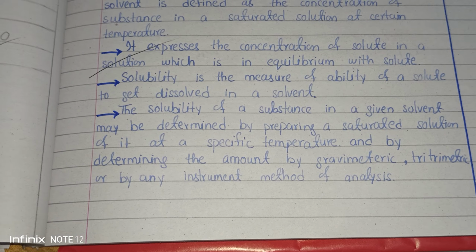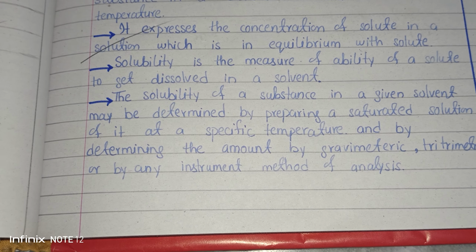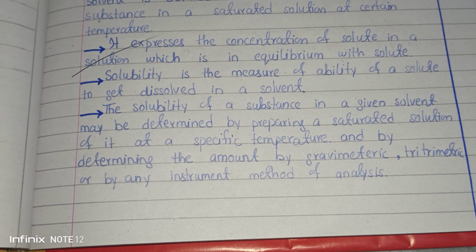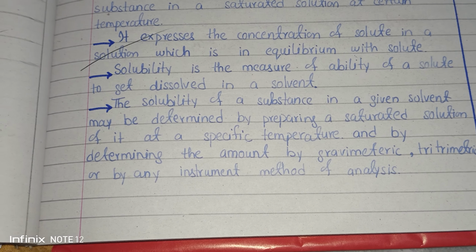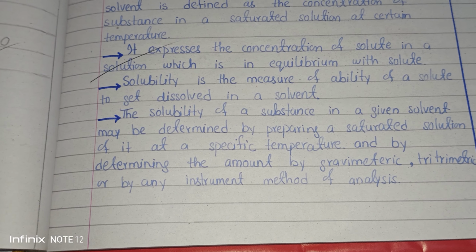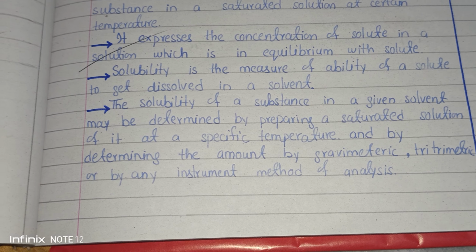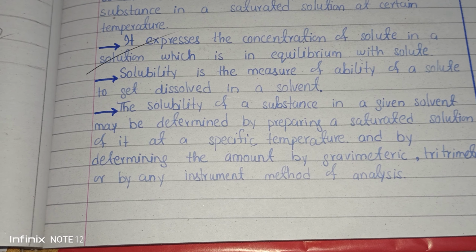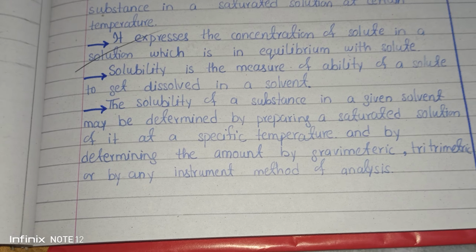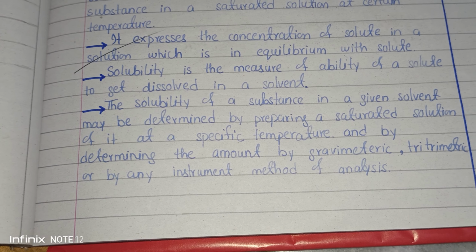I will explain with the help of an example. For example, you are given a beaker full of water, and you are asked to prepare a sodium chloride saturated solution. Then what will you do? You will take some sodium chloride and start to add it into the beaker of water, then stir it and dissolve it.